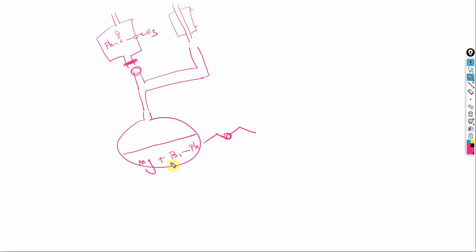So we'll first let this reaction happen between bromobenzene and magnesium, and that will create the Grignard, which is phenyl magnesium bromide. And once you have given it enough time, you will now open this and you will drop the electrophilic reagent, and the electrophilic reagent reacts with your phenyl magnesium bromide, and it is going to now produce the triphenyl methanol. Triphenyl methanol has three phenyls, one with one bond each, right?